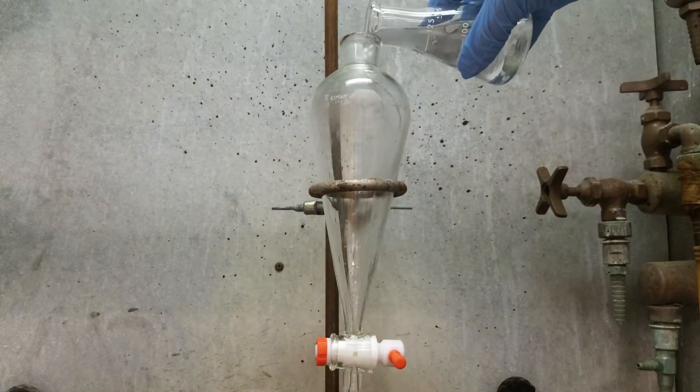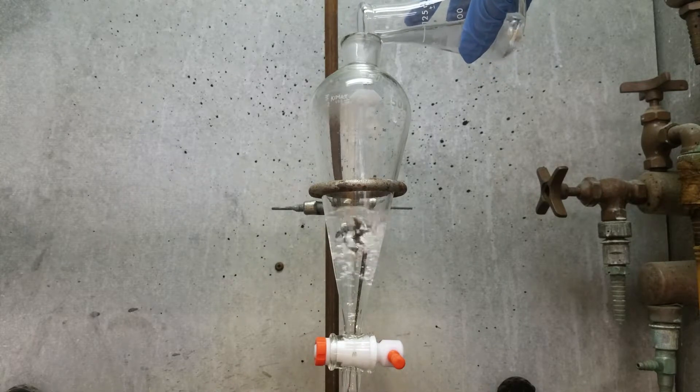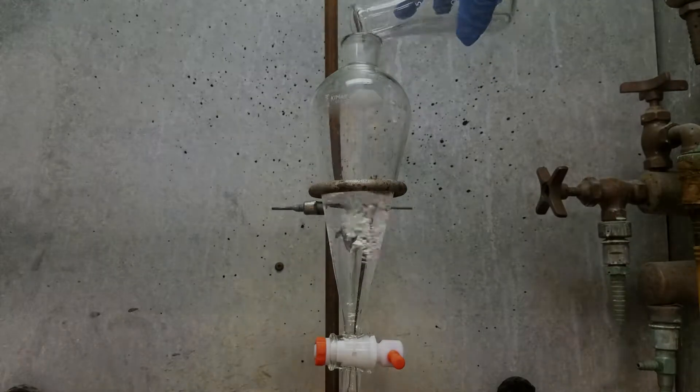The liquid-liquid extraction consists of two phases, an aqueous phase and an organic phase. These two phases are immiscible and form distinct layers.